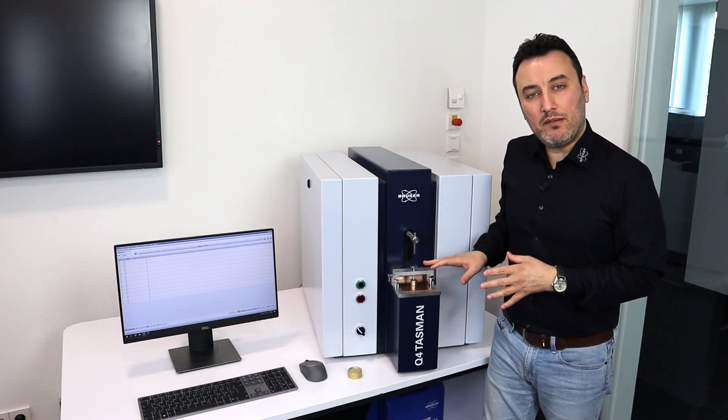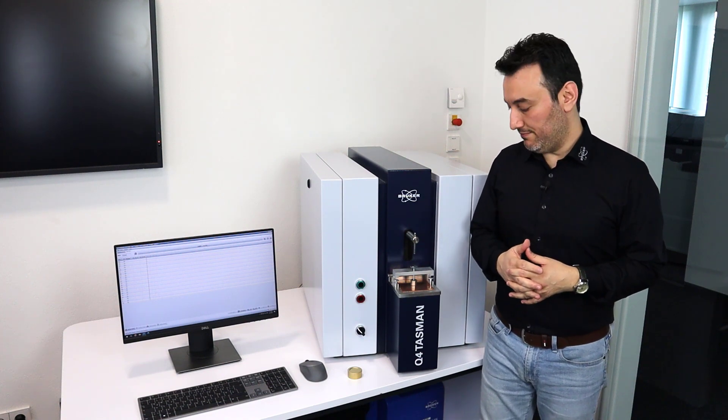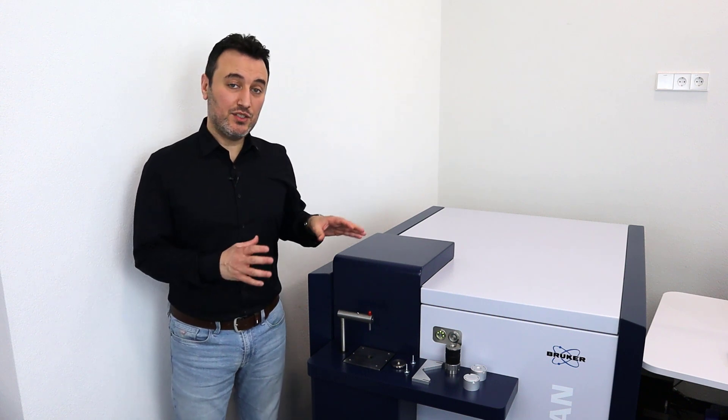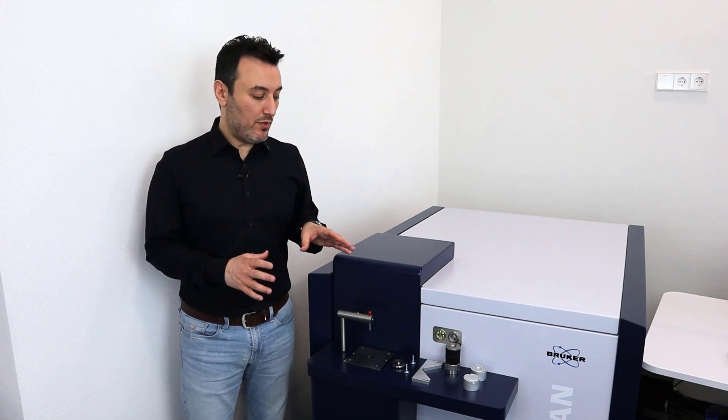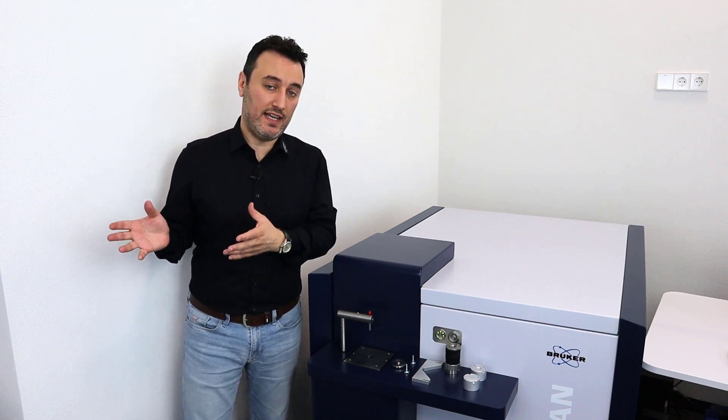This adapter is also compatible with the Q8 Magellan. I'm going to move over to the Q8 Magellan now to show you some other adapters. Now I'm next to the Q8 Magellan, and I want to show you one last adapter which is required for all other circular adapters available for the Q8 Magellan and Q4 Tasman.